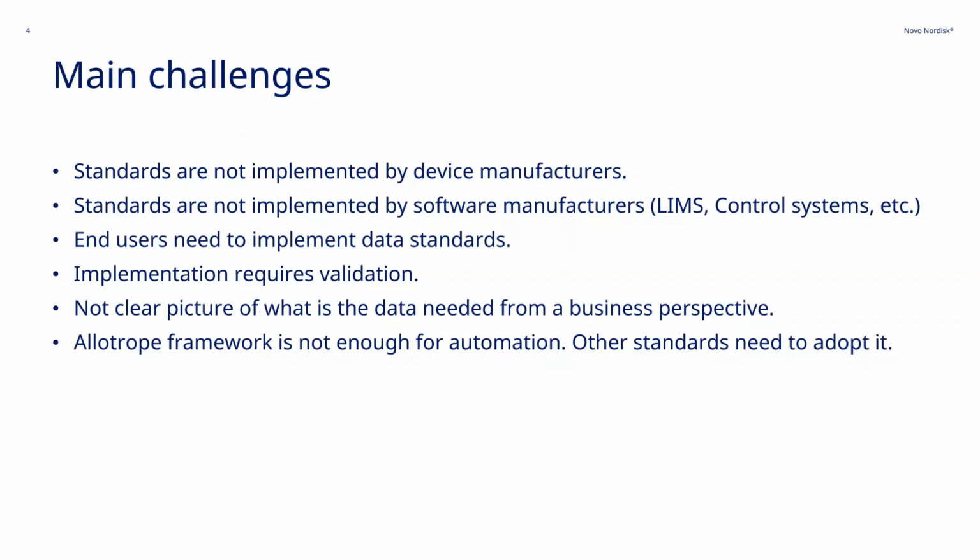You need a communication protocol. You need to send commands. You need to receive commands and things like that. And that functionality needs to be added somewhere. And there's also no ready-made tools to do that. So there's a lot of work on us on how to do that.